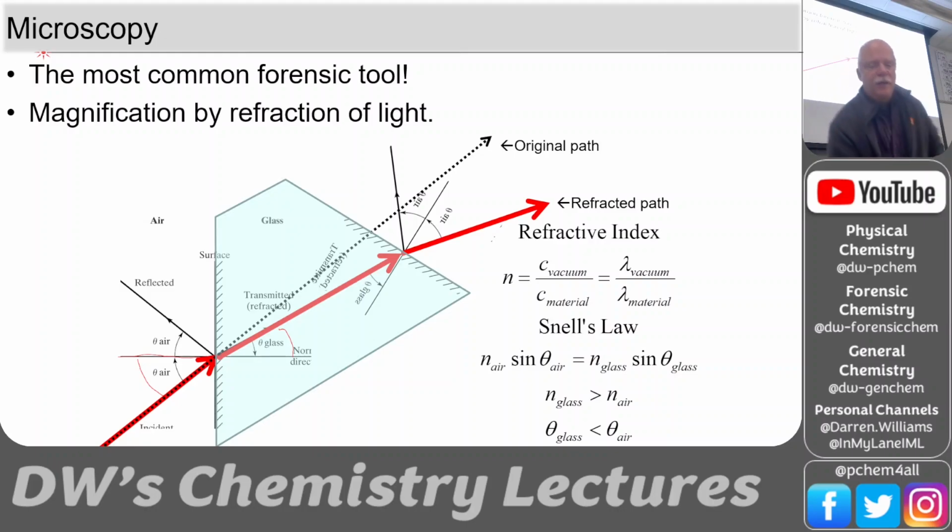This is, again, the speed of light. You may have heard the speed of light is a constant. Well, it's defined as the maximum, the speed limit of the universe, and it's defined in a vacuum. When light enters a material like glass, it slows down. What slows light down is its interaction with the material. It also slows down in air. In particular, for the light that we're concerned with, it slows down in anything that has electrons. And what has electrons? Pretty much anything, even air.